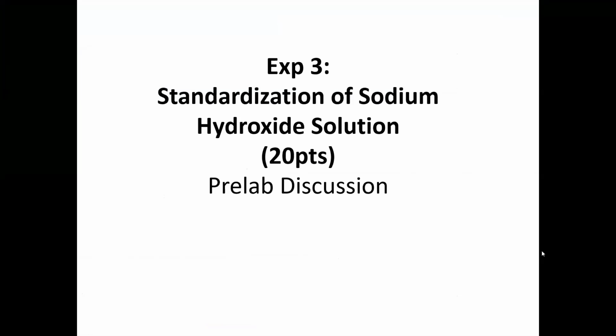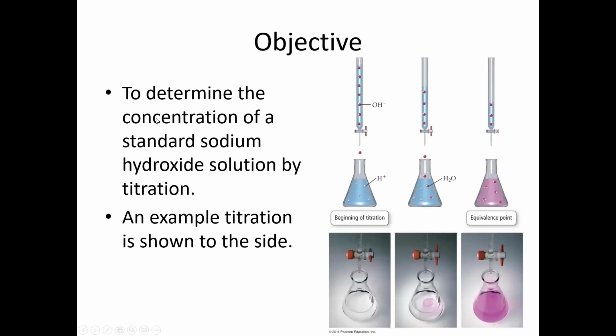In this lab, we'll do a standardization of a sodium hydroxide. The objective is to determine the concentration of a standard sodium hydroxide solution by titration.